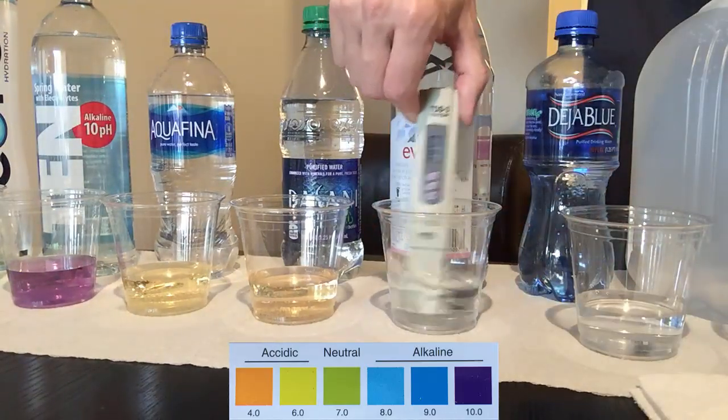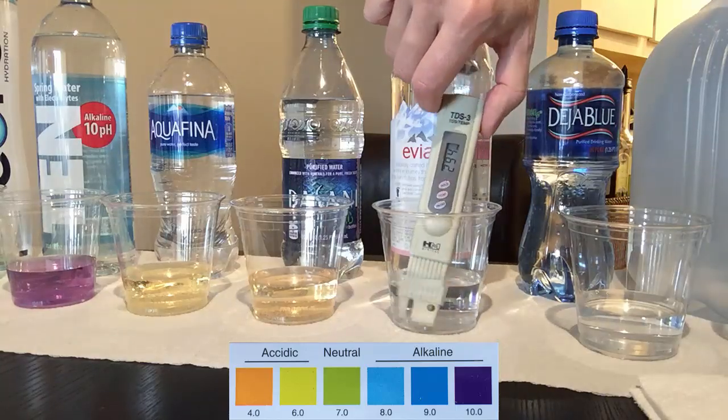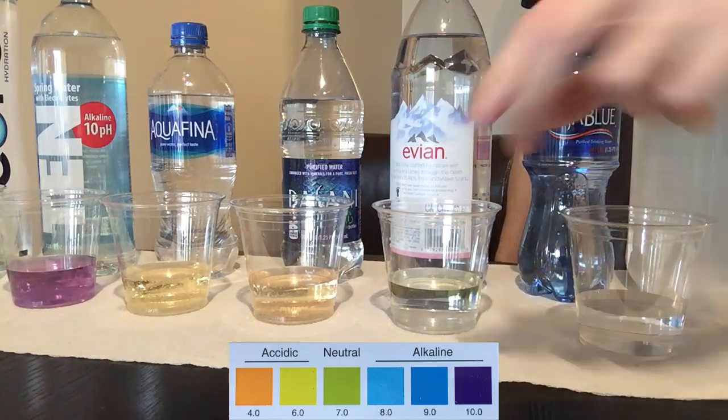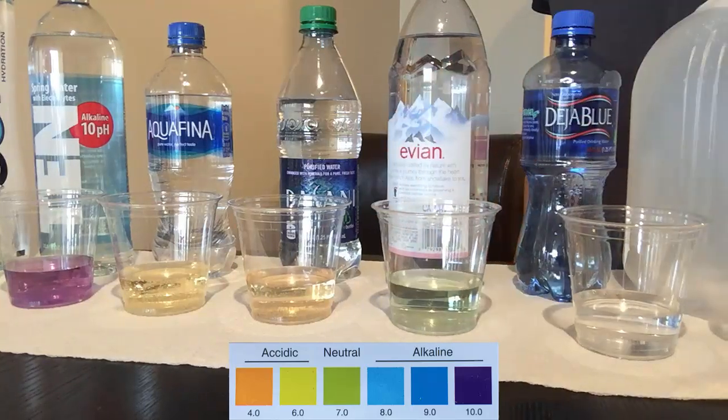Evian is a natural spring water from the French Alps, which claims neutral pH and a lot of minerals in the water. You can definitely see that with a very high TDS reading at 294 — which is even higher than my tap water at 200. The pH level is just about neutral, as promised.